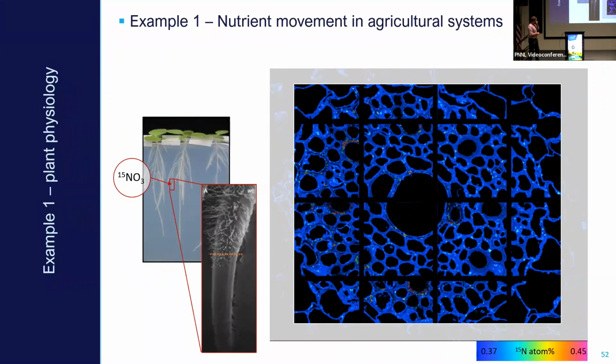So there are a couple of things that are pretty interesting with this data. The first one is, for the isotope savvy people out there, you'll notice that this is really subtly enriched. Generally, when people do these types of experiments, they want a big number before this decimal place here. They want 10%, 15%, to be sure. But what we've been working at quite a bit here at EMSL is working down at that small scale, looking for really subtle shifts. So we don't have to bombard the samples with unrealistic amounts of isotopes to answer our questions. I think this is a perfect example where we see exactly where the isotope is. It's not very enriched, but it's significantly enriched, and we're pretty confident about that.